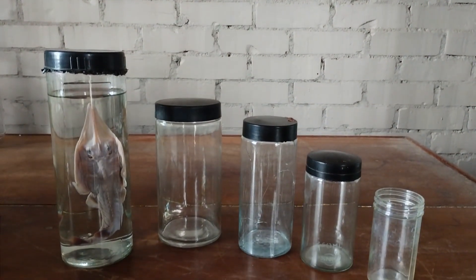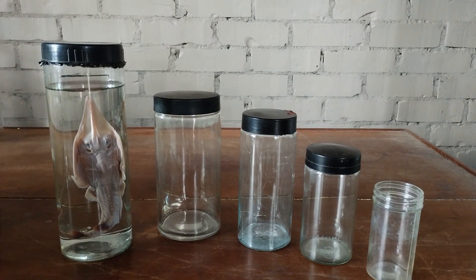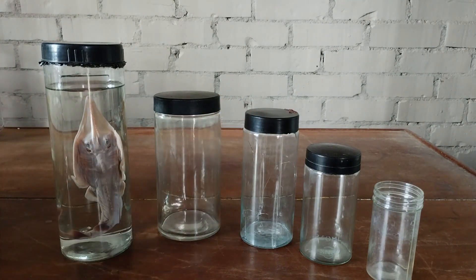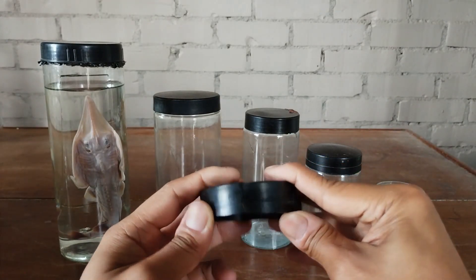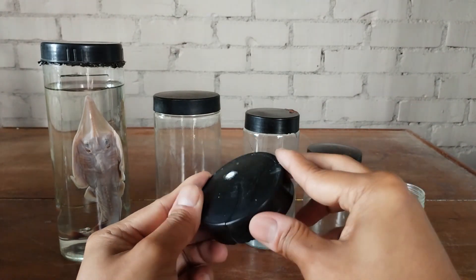Another type of specimen jar which is equally popular is what is known as the bakelite jar, getting its name from the fact that the screw cap is made from a plastic material called bakelite. Bakelite jars are also cylindrical in form and come in varying sizes, usually made of glass — either borosilicate or soda glass. The main problem with bakelite jars is that the screw cap is quite prone to cracking and breakage, especially when opened and closed on a regular basis for specimen inspection or other reasons.